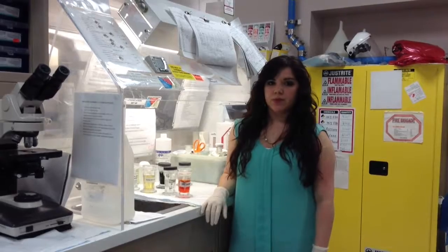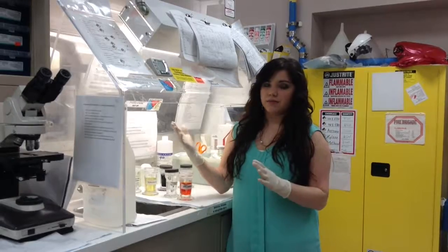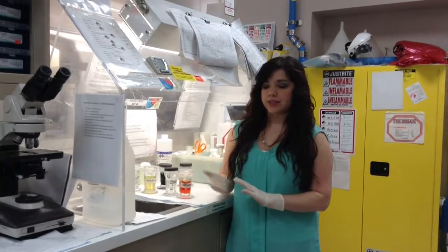For day 3 of the summer rotation, you will be reviewing bronchial cases with the student. This includes bronchoalveolar lavages and bronchial washings. You should save bronchial brushings for day 4, as they will be taught together with GI tract brushings.